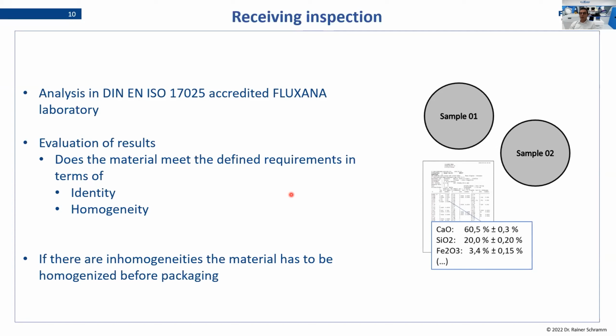And in this way, we can make sure that we see already all the troubles and all the specialities which depend on that material, and that we can really find out what problems could appear. Is this material really fit for the purpose? So important is then that the material is homogeneous, and that the concentration ranges correspond to the expected values.